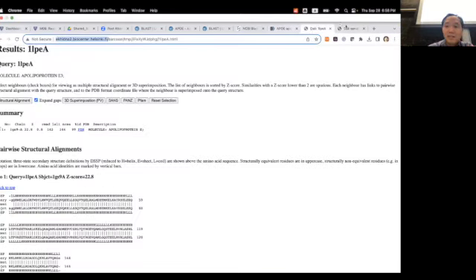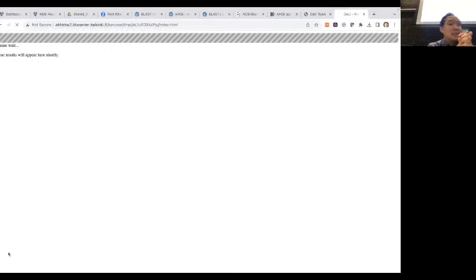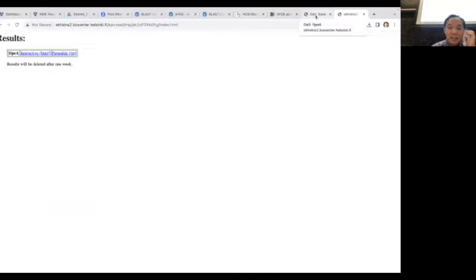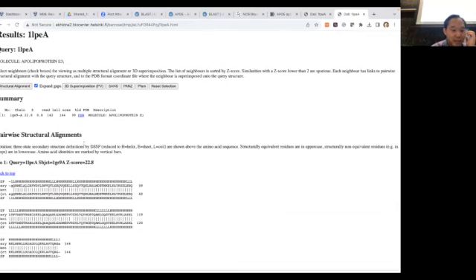You will get something like, do you want to get the HTML file? So click that HTML file. And you should see the interactive HTML. So if I click the interactive HTML, this is the sequence alignment at the protein level, and there is a cysteine to arginine change in here.